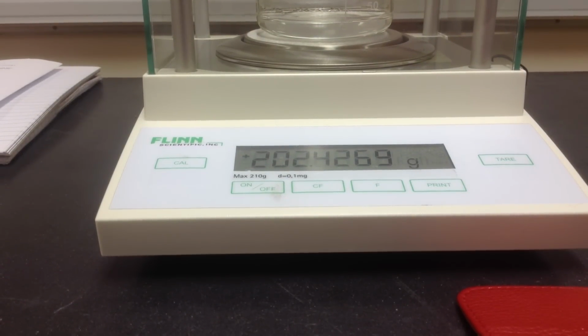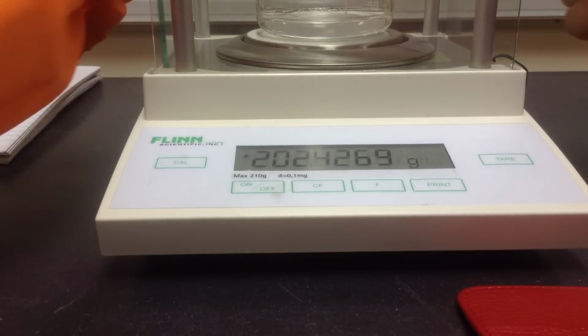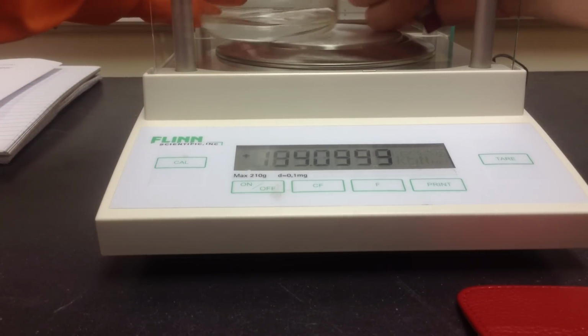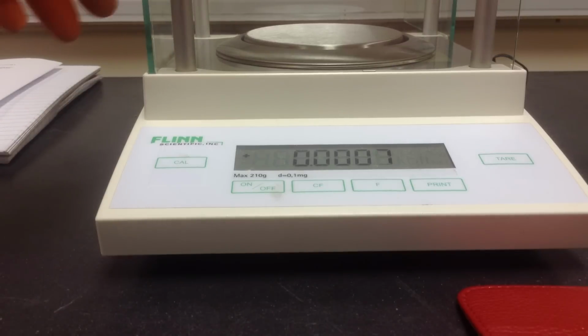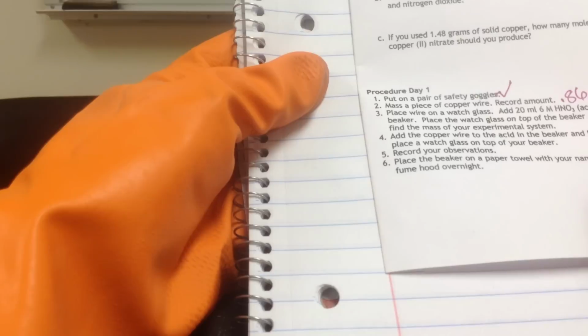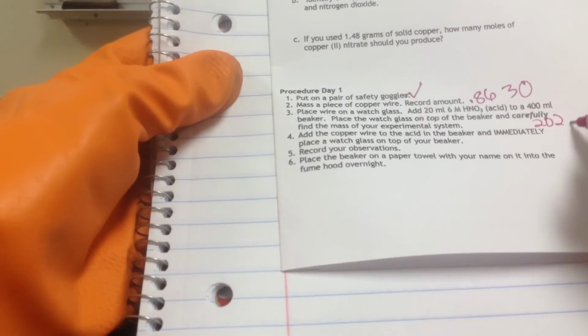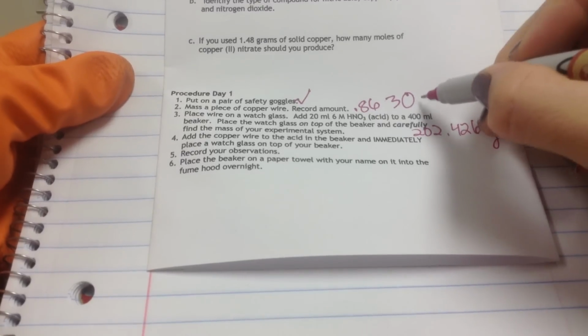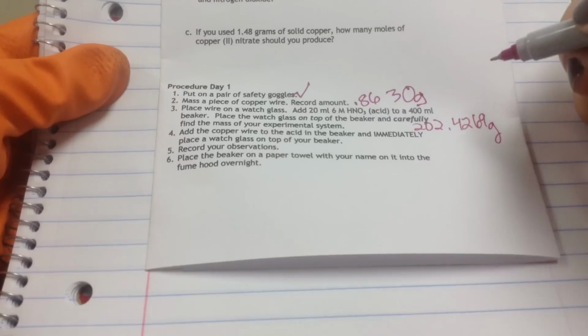Let's see, 202.4269. Oh, and this is grams. I should have made sure that I put grams as my unit here as well.